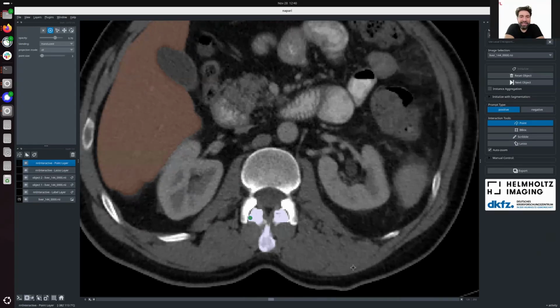Hey, thank you. I'm sorry, it's not directly related to the presentation, but seeing you scrolling in the Z made me wonder, did you try to use it for tracking instead of segmenting objects in 3D? Like if you have, for example, a cell moving on a 2D plane across time, is that something you have tested? So you can definitely just interpret that as a 3D image and try segmenting it as a 3D object. That should work.